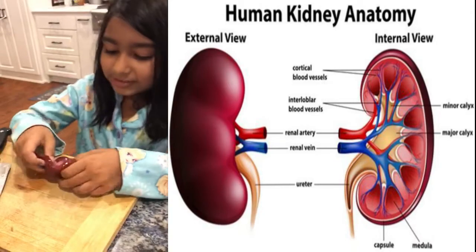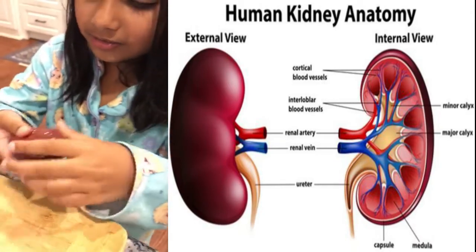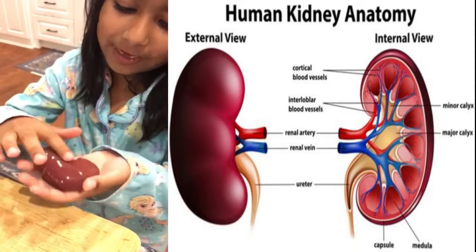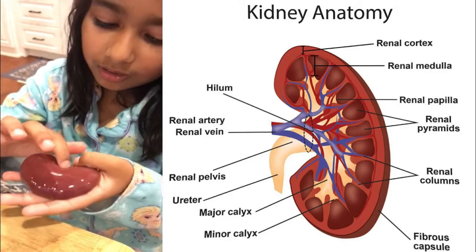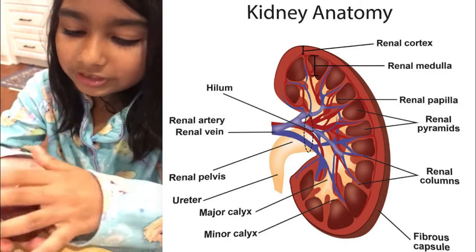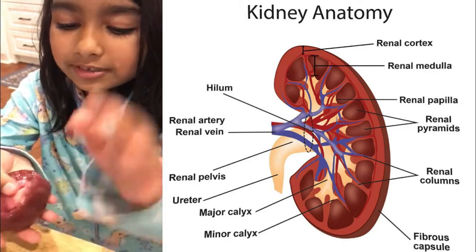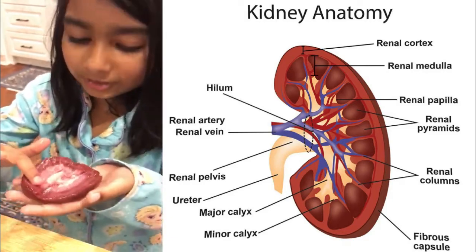You can see the inside. It's a rare red color that's really dark. This is part of the last layer, showing at the outside which is the top of it. And the kidney's job is to filter blood.